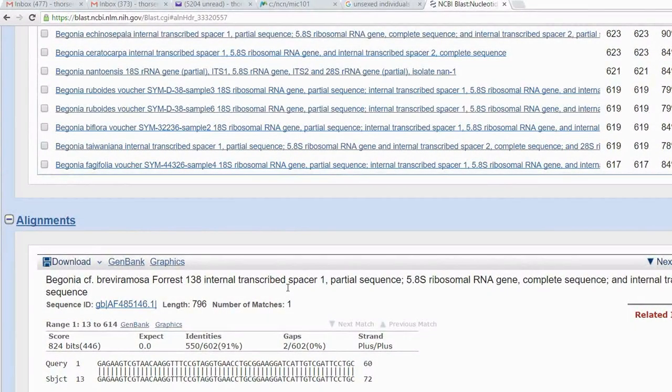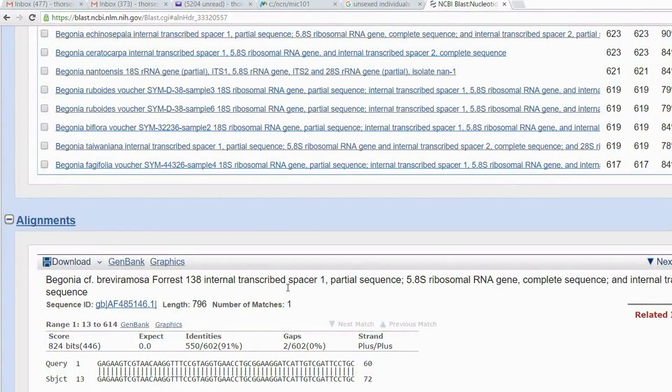Shows the sequences in the database which are similar to the sequence. And then they show the similarity. So, the similarity is 91%. This is how you can do this. So, this is GenBank.